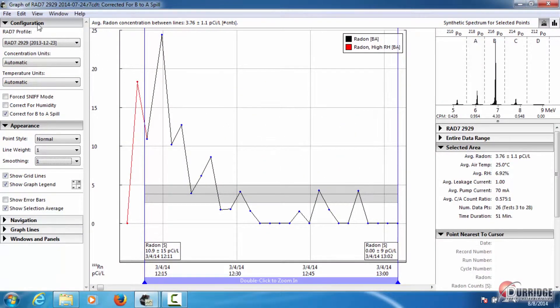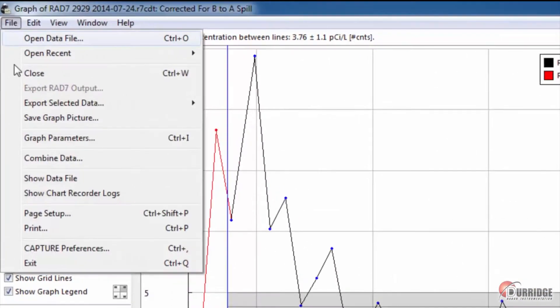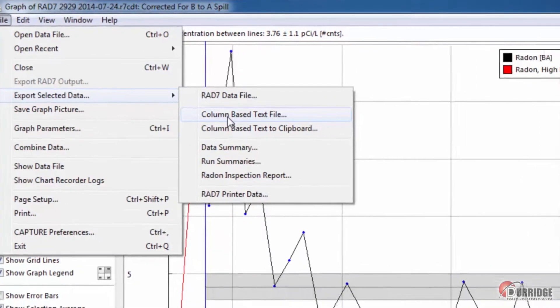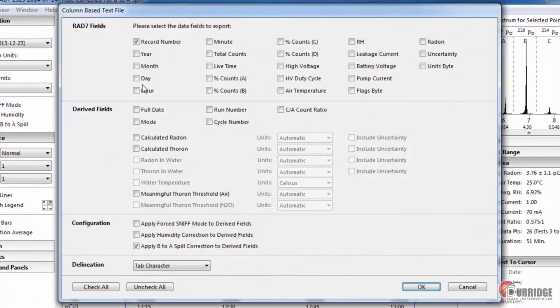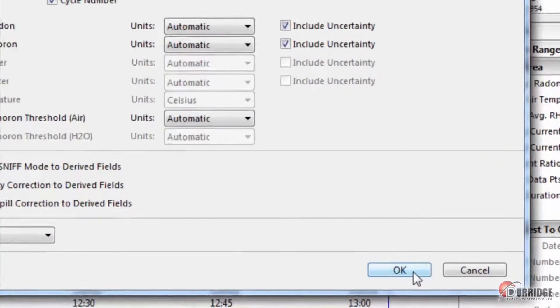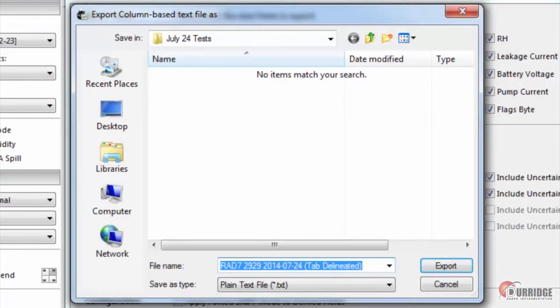Exporting as a column-based text file saves the data as a text file that can be opened in Microsoft Excel or another spreadsheet-based program. If you select this option, Capture presents a window in which you choose the information that you want to include in the file. Click Check All to select all the options. When you click OK, pick a location and name to save your file.